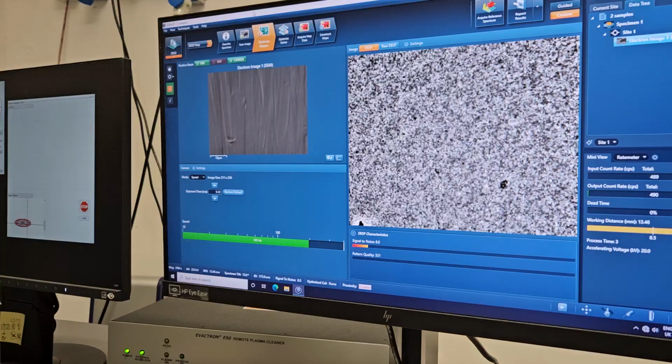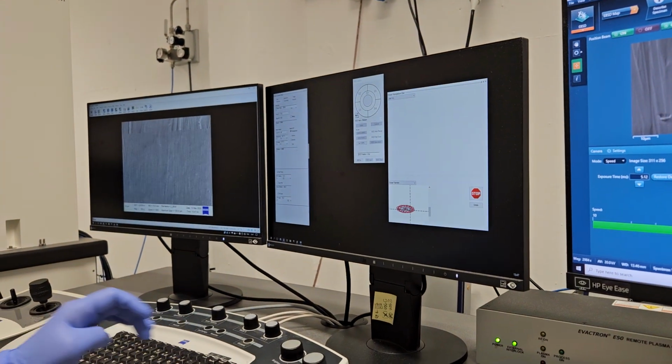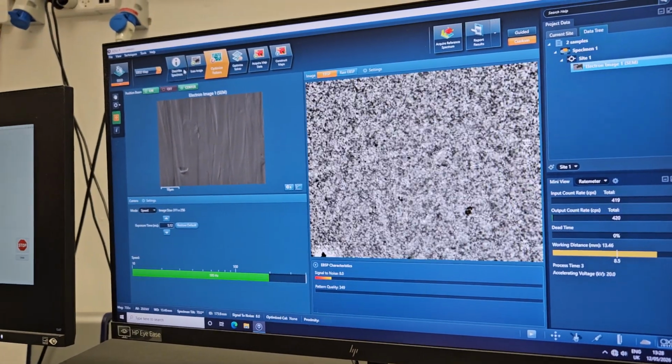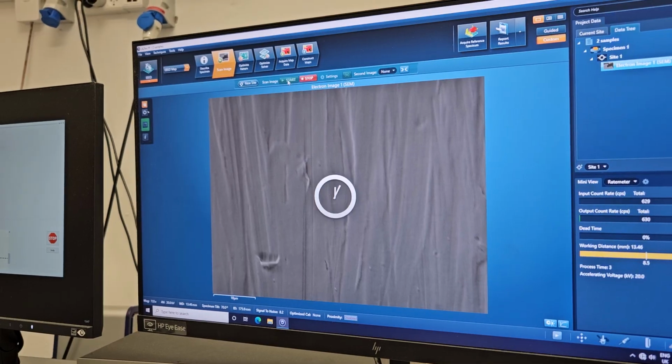Okay, so yeah, let's go back to 300. Take another image.